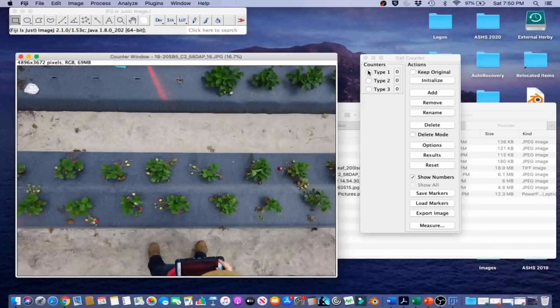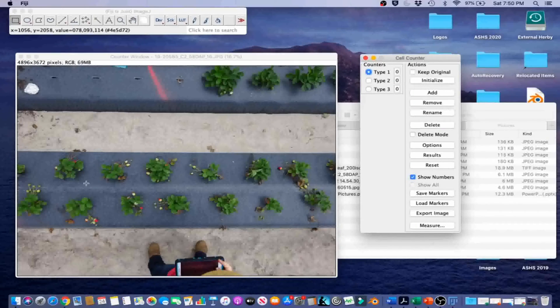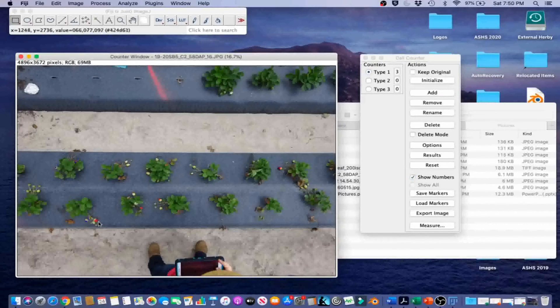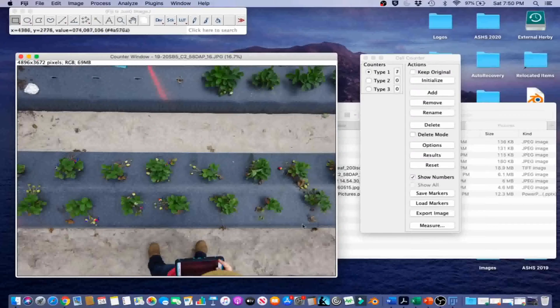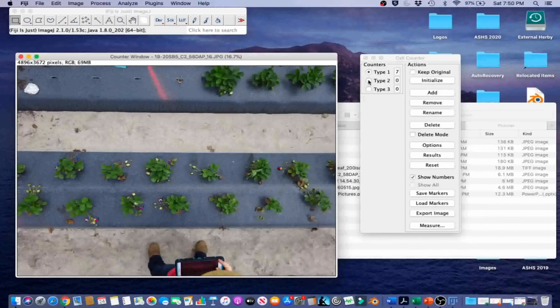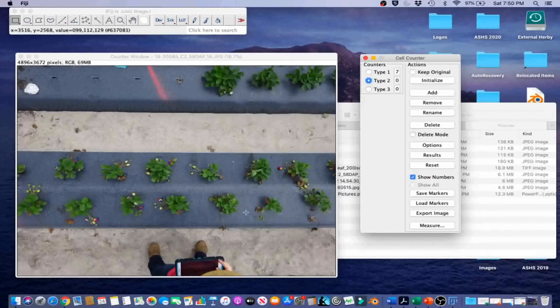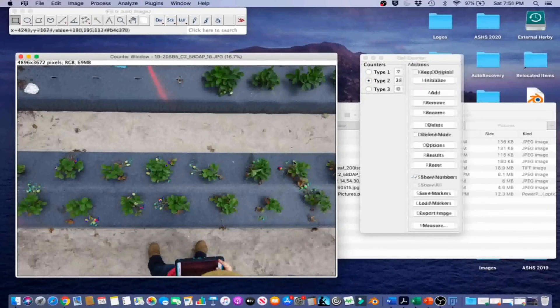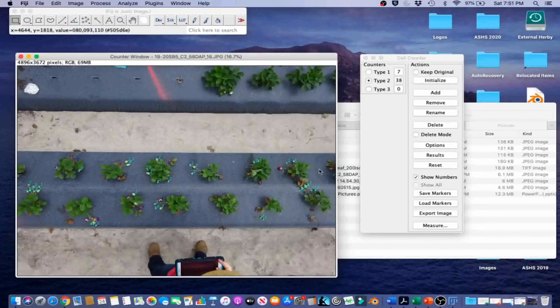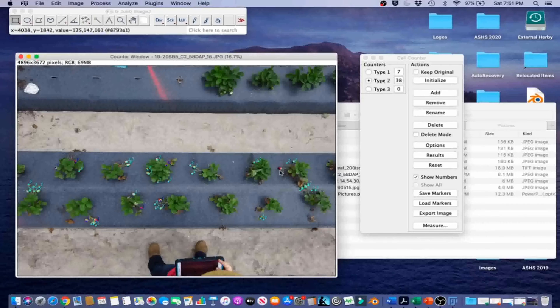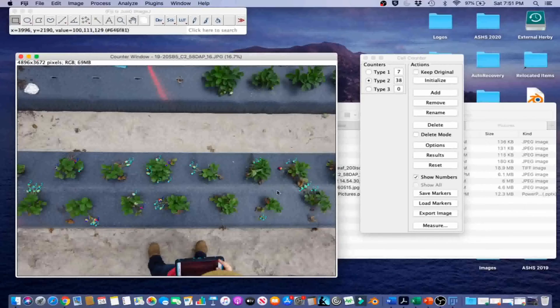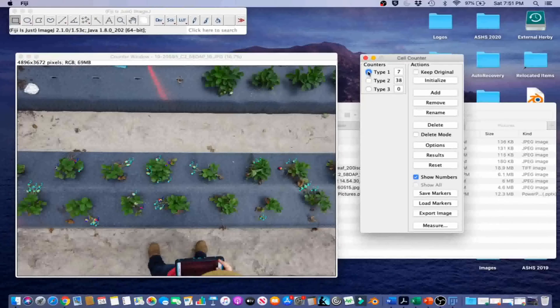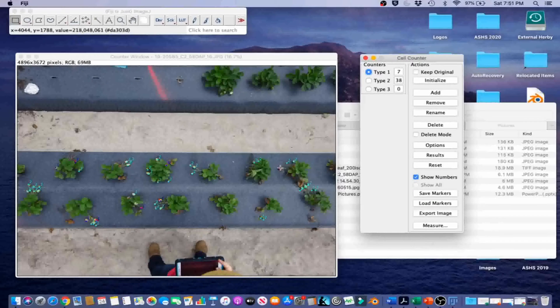That means that we can start counting. We're going to click Counter Type 1. We're going to start with the red fruit. Go ahead and click some of these fruit. Now we're going to go on to Type 2. Click on the white fruit. Now, if you notice, there's actually kind of an obvious red fruit that I missed from earlier. If we miss any fruit from a set of categories, we can always go back. I'm going to go back to Counter Type 1, and I'm going to select that.